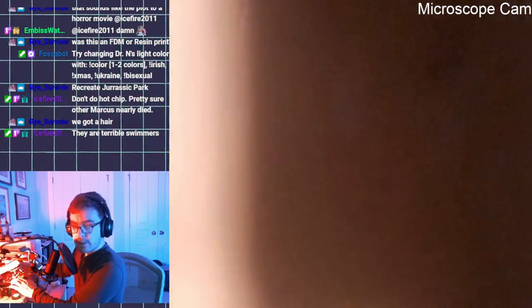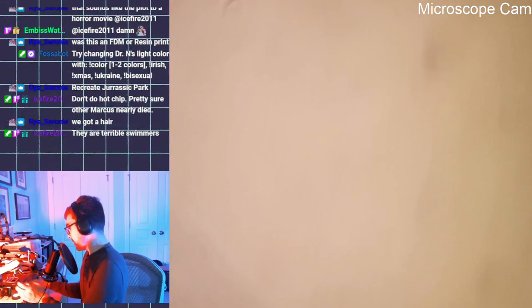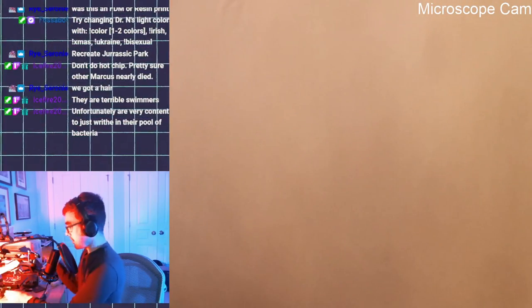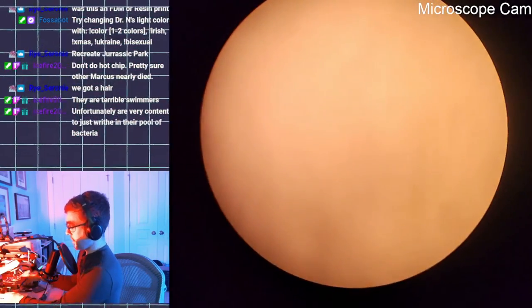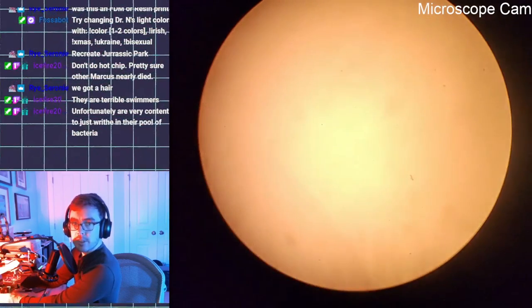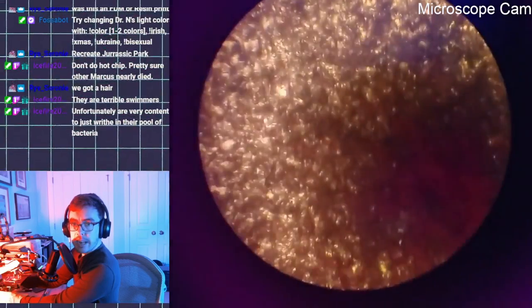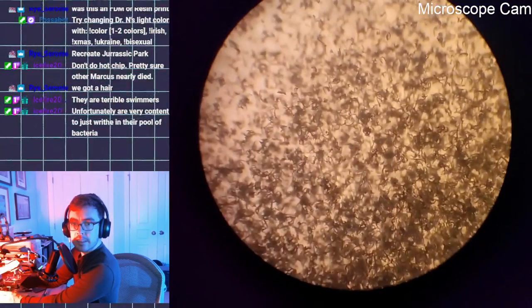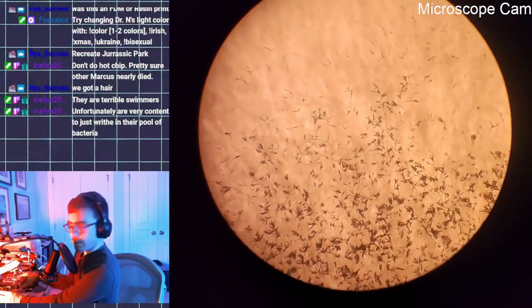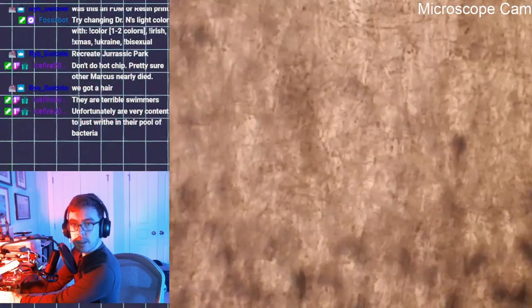You know, actually, I do have this other plate. It's not made for C. elegans, and it's infected with something. Zoom out. I was just going to show this because it was kind of cool. It's infected with a fungus, so we can see the fungus right here. This is what's called an apple juice plate, but a fungus infected it.